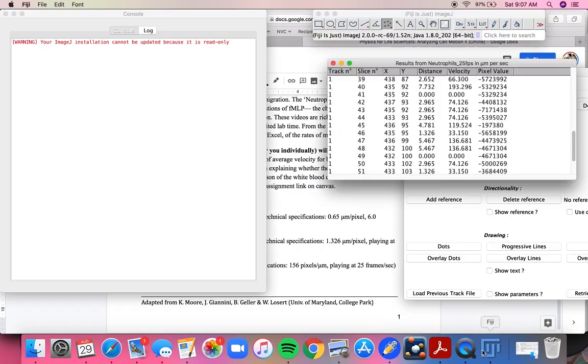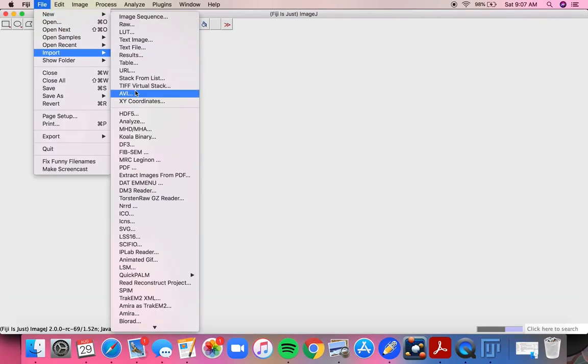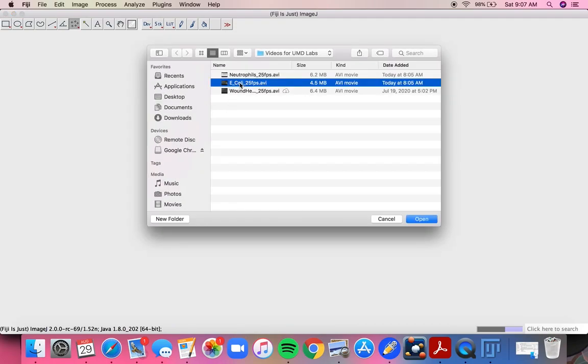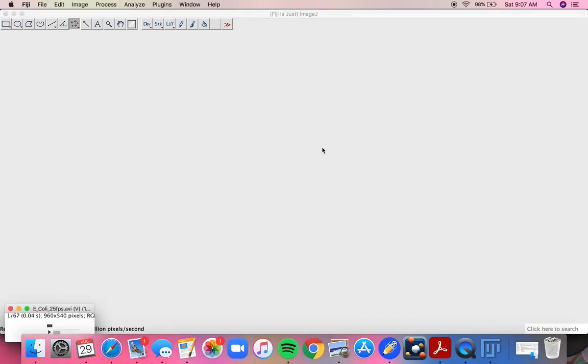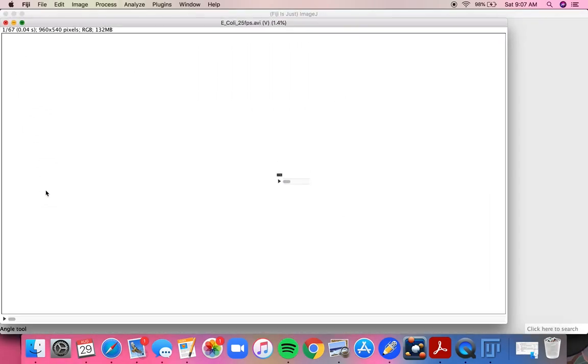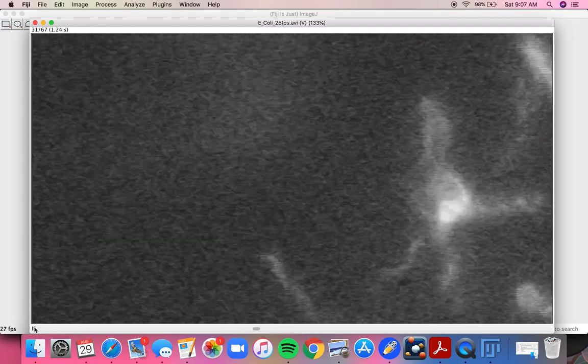So now we'll go back to the software here. I'm going to do File, Import, AVI again, and this time I'm going to do the E. coli. And this video looks like this. If I play it, you're going to see these guys going.